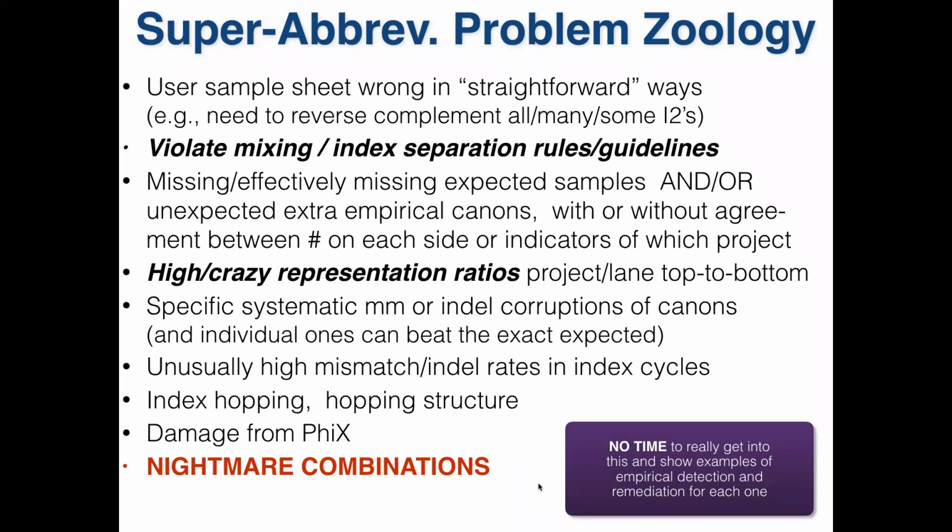Now, you always worry in those cases, but a lot of the times if you've got a mix of 20 with one missing as a 0 and extra representation with the others, the one missing is that one extra. But then you get cases where people are missing 12 and you've got 6 extra.